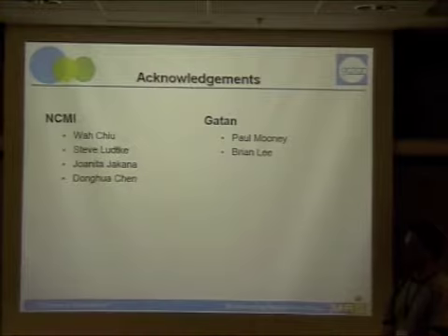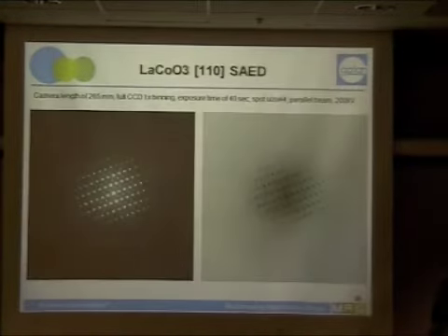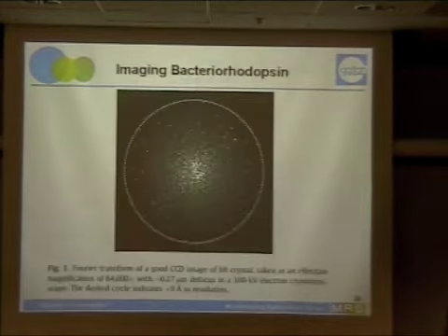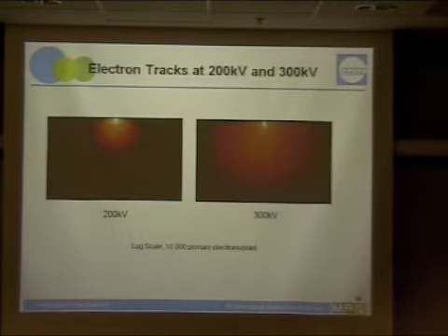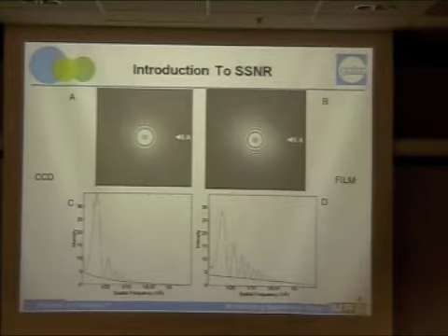My personal one, having told you, is how many pixels do you have at the spatial frequency where the MTF falls to 0.5. If you could scroll back to the slide that showed the CTF, the circular CTF without the background subtracted. Sure. Oh, keep going. This one here? Yeah, okay.